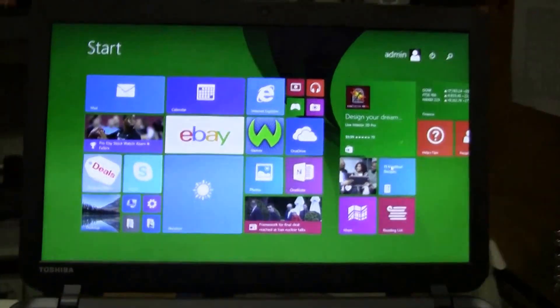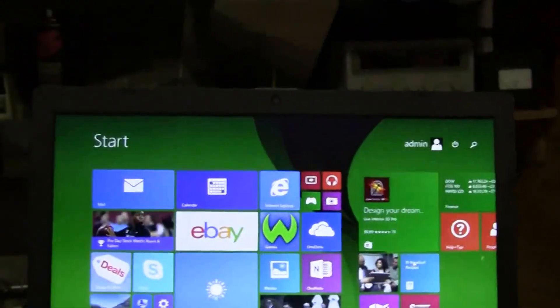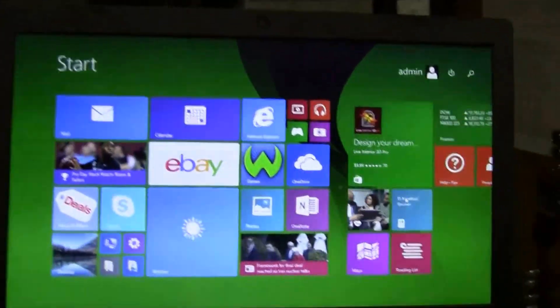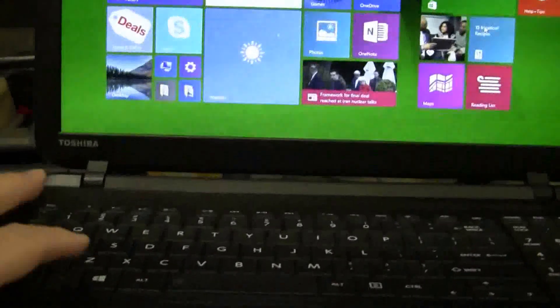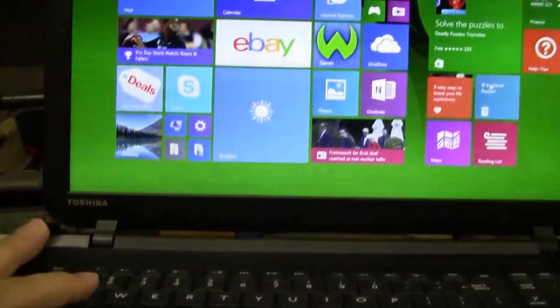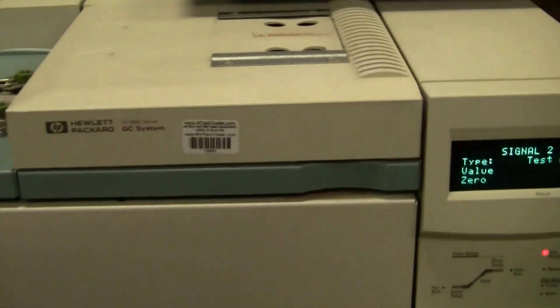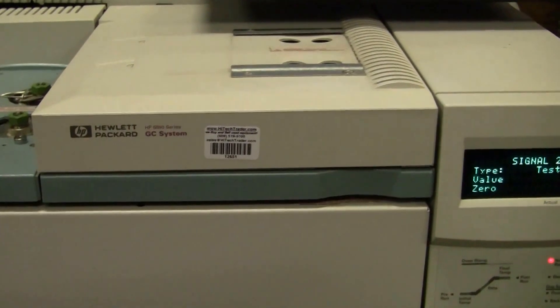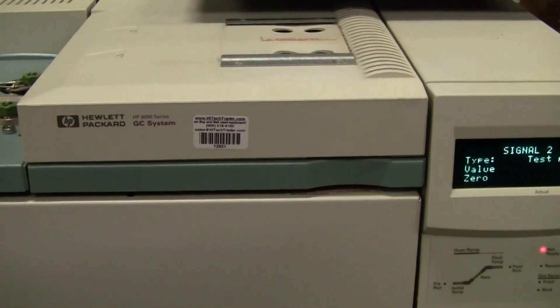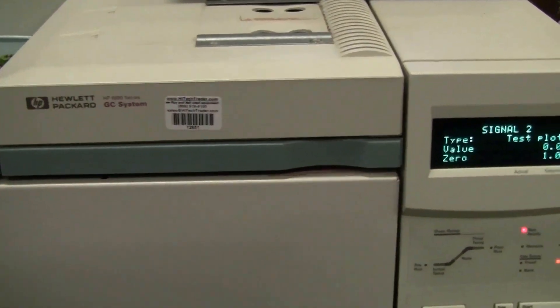Hi, this is Michael from HitechTrader. Today we're looking at a Windows 8 computer and we're running a 6890 Hewlett Packard Agilent 6890GC system.